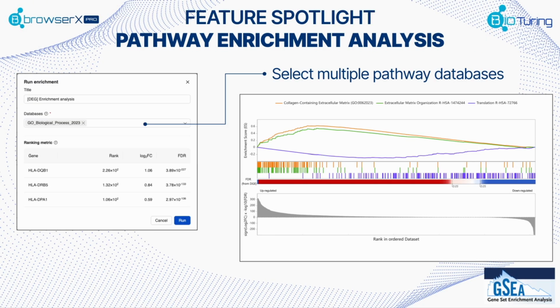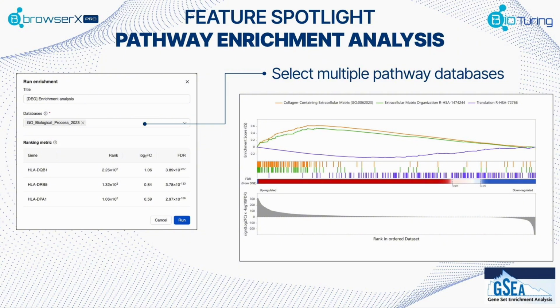Following differential gene expression analysis, you can also perform pathway enrichment analysis, in which you select for multiple pathway databases to perform the enrichment on and visualize the results in a gene set enrichment analysis plot.